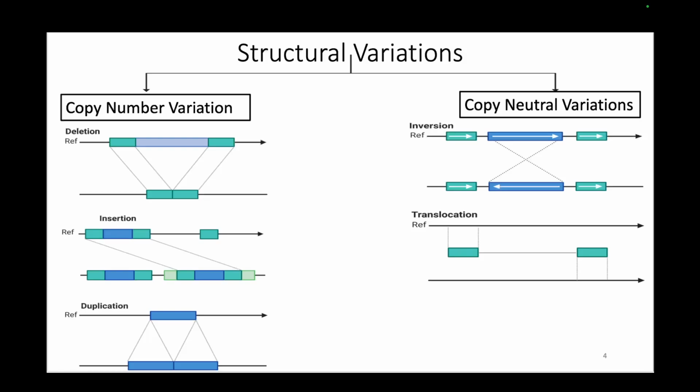So these are strategies adopted by these variant callers for big variants. We are talking about more than 50 base pairs. In most cases it will be around 100, but there will be some very big duplications or deletions. If you look into the Y chromosome, you'll find very big duplications, like 70,000, 80,000 base pair duplications.